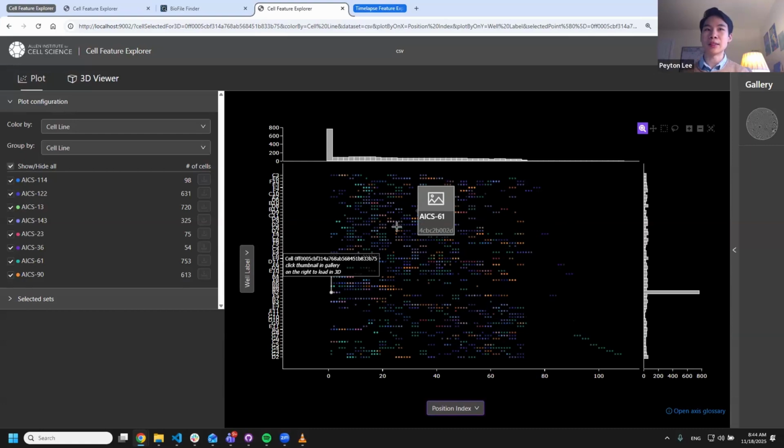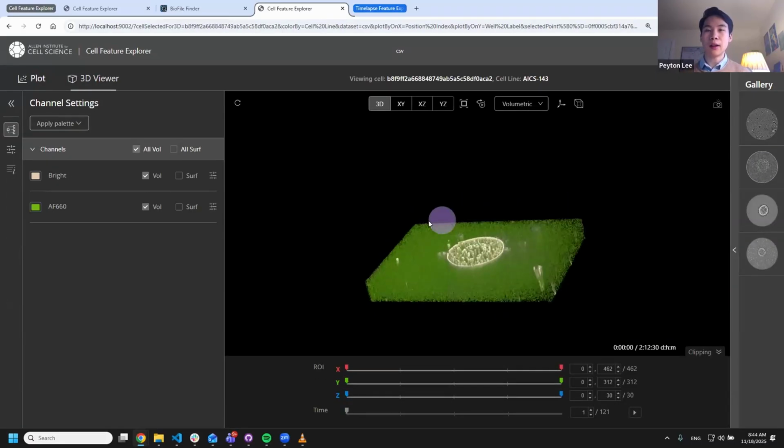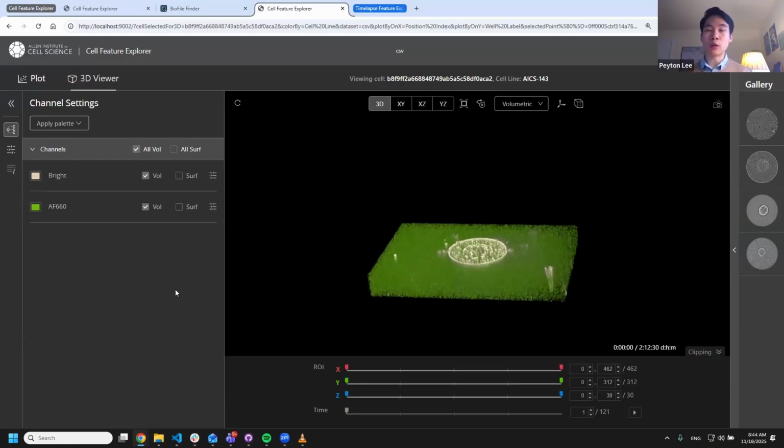And so you can see that this now has some of those representative images in here, and I can click into these. If I hover over them for long enough, we're dynamically generating thumbnails based on that data. And if I go over here, I can now preview any of those files in Volley. So this becomes a way that if you have a large number of two-dimensional images and you're really interested in exploring them, or even three-dimensional volumetric data, you can do all of that from this really nice plot view.